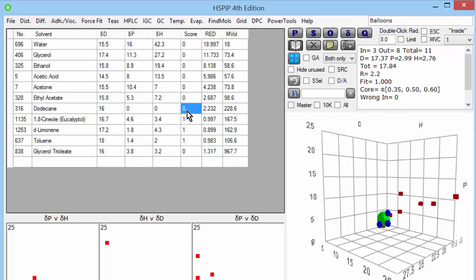That means it doesn't deserve a one. It deserves a two. It's not very good, but it's still okay. Now if I click this, I get the same result. Because I'm only letting those things which are called a one be defined as good and everything else is bad.